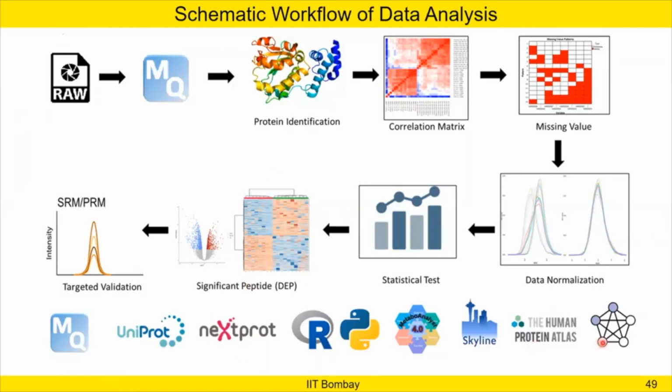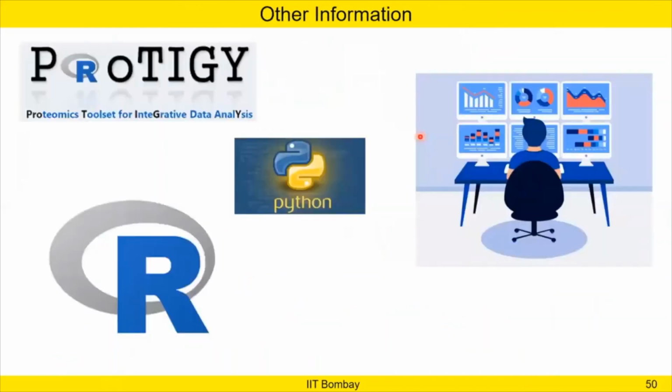So I have given some logos of the software which we heavily use in our lab, and you can also check this software. And I think most of the software, except a few, you will learn today, like Professor Sanjeeva told about the Human Protein Atlas, and you will learn about Skyline. I told about MetaboAnalyst, right?